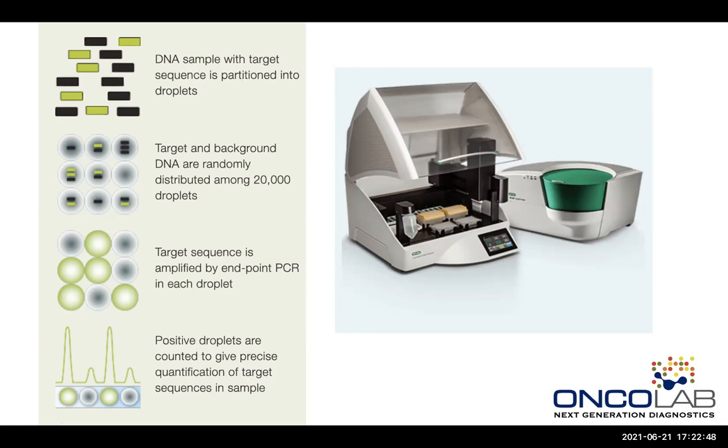I say that with some reservation, in that I would still include a housekeeping gene even if I were running this absolute quantification, because otherwise changes in pipetting or small errors might make significant downstream problems. But we use this instrument, it works very nicely.